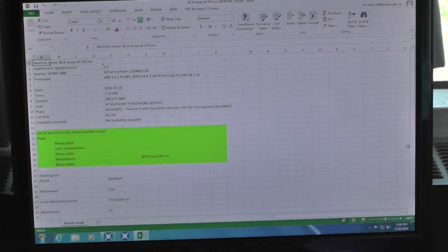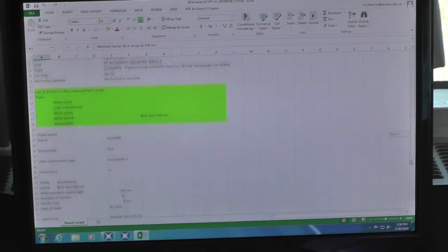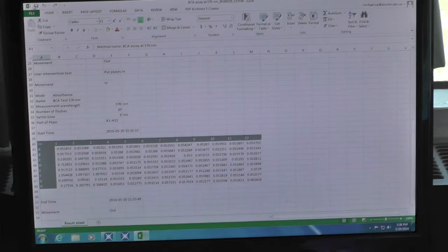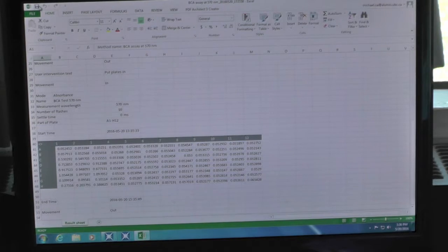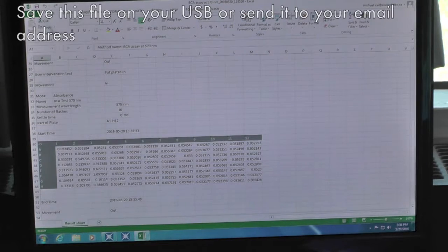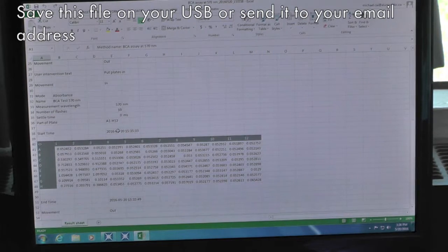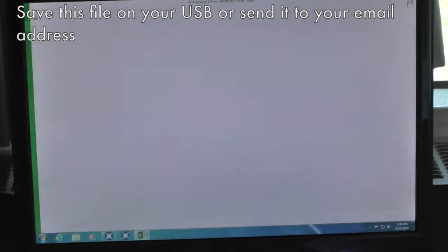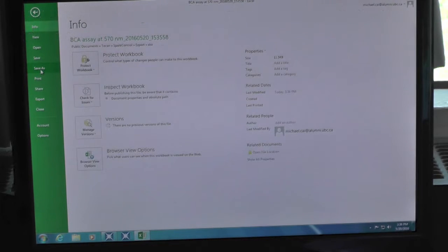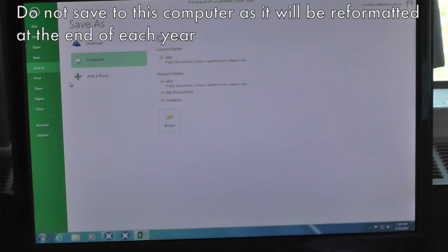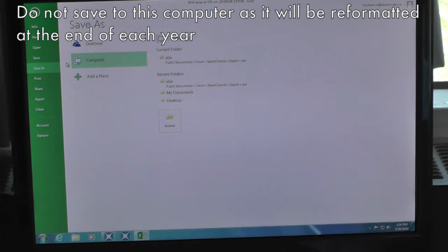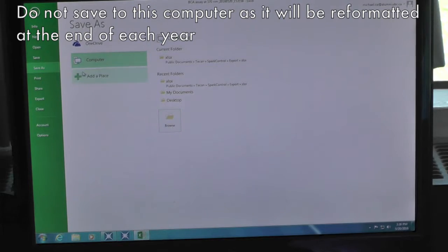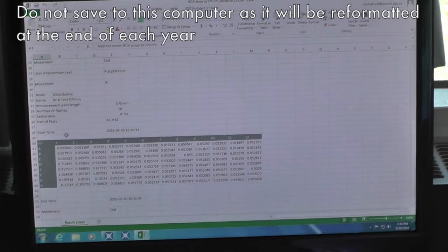An excel file will be automatically generated with the program details and your results. Please save the file on a USB drive or send it to your email. The computer will be formatted at least once a year without notice, so it is advisable not to use this computer for data storage.